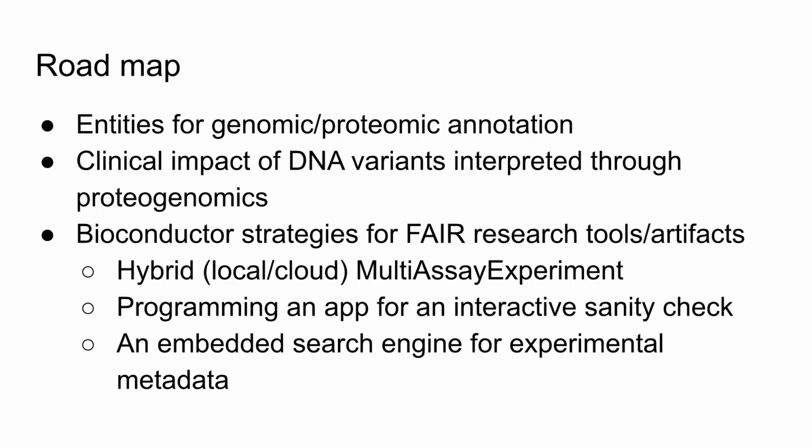Then we'll talk about the idea of an app. These apps are things that you just sort of point a browser at or you point your phone to, and computations happen. Things that are interesting can be done. We'll talk about how to program an app for some of this proteogenomic data to help us think about whether the assays are consistent with one another, when they differ, how they might differ.